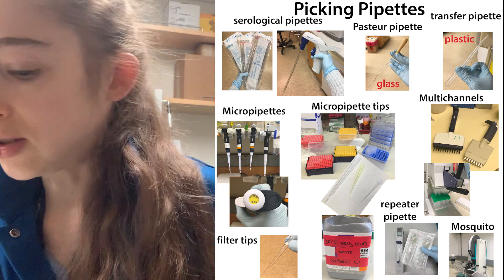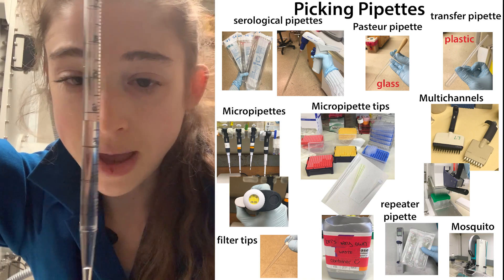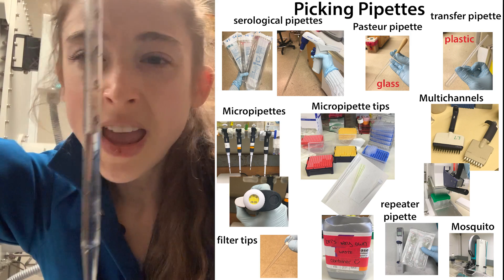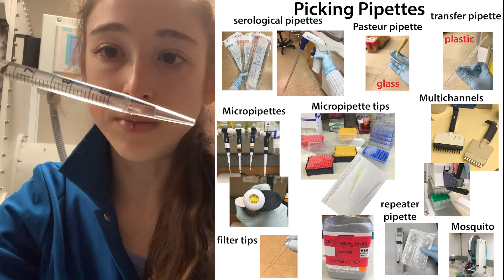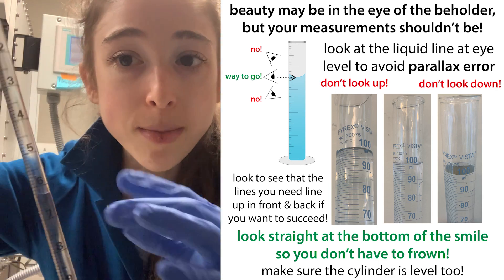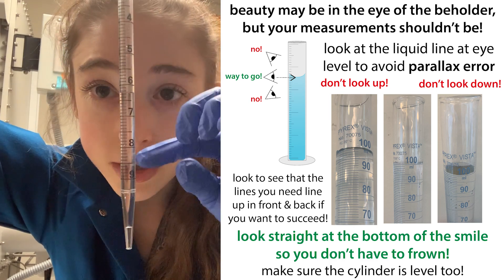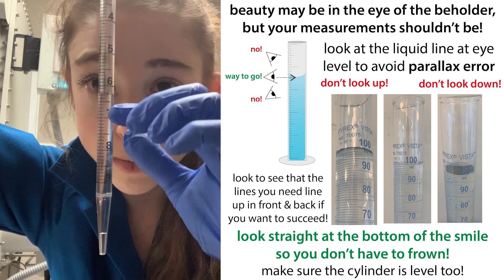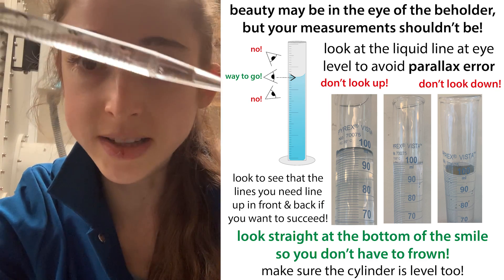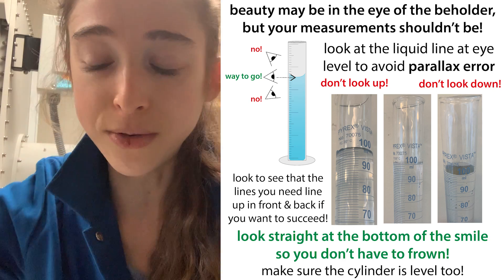It's also important that you measure from the meniscus when you're using a serological pipette. This can be more difficult because you have to kind of hold it up, and when you're pipetting you often have things at an angle. If you really care about accuracy, you want to hold it up and make sure that it's level and your meniscus is right on the line. Sometimes we don't care that much about the accuracy, so when it's at an angle, see what it looks like in between, kind of halfway.